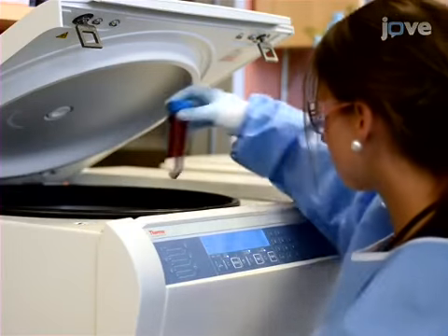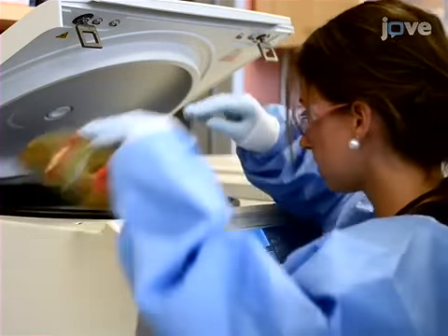Meghan Hart, a research technician from our laboratory, will now demonstrate this procedure.